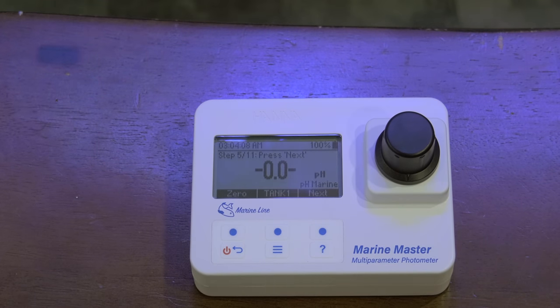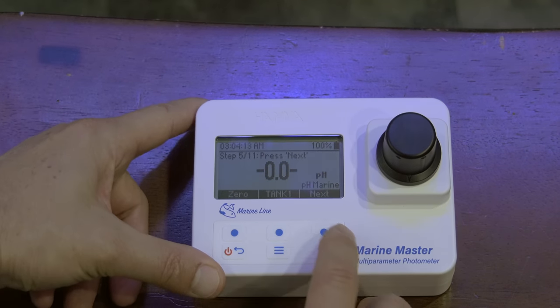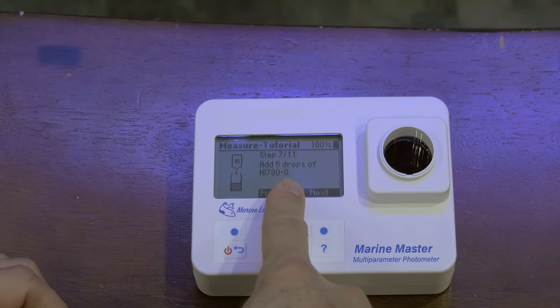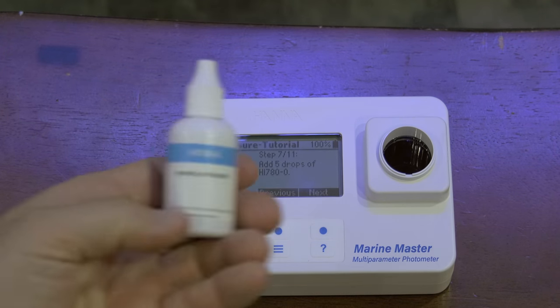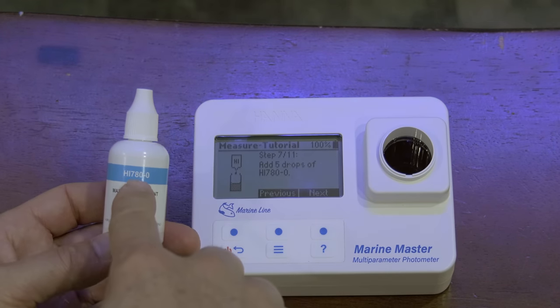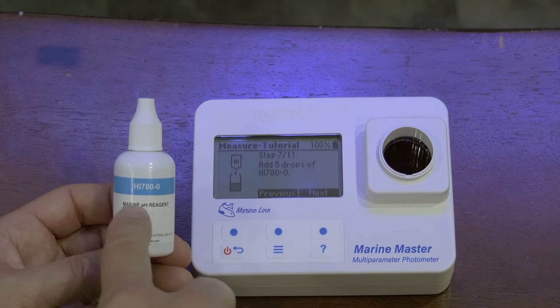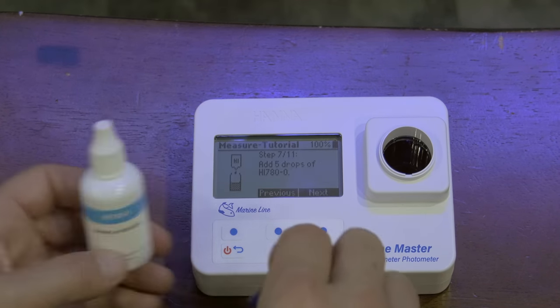Zeroing. That's nice — it zeros every time, which will help make things more accurate. Press next. Remove cuvette. Add five drops of HI-780-0. Looking in the kit — that's this one. I like that it gives me the number so I can match it on the bottle. It could just say 'add five drops of pH reagent' and you could probably figure it out, but there's no guessing because it's giving you the number. That's cool.